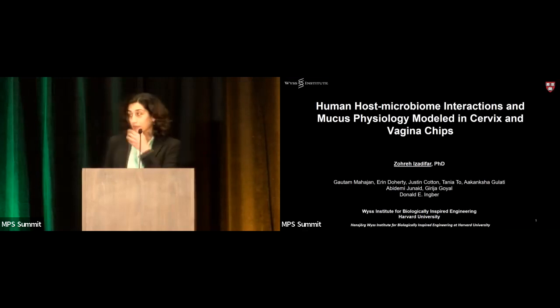So in my talk, I'm going to talk to you guys about the human cervix and vagina chip models that we have developed in our lab to model the human host microbiome interaction, as well as the physiology of the mucus.